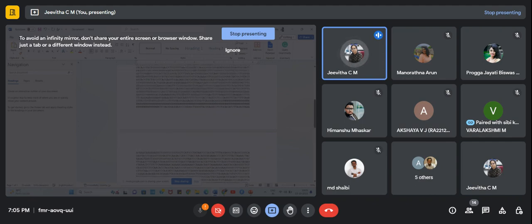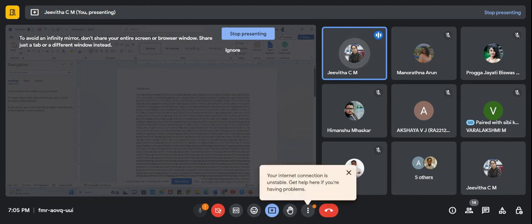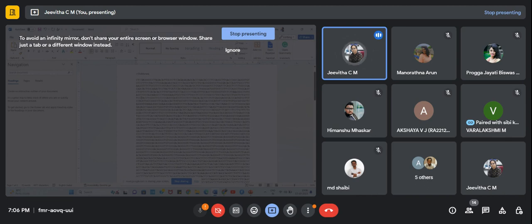So I'm pasting it in a rough page. We can forget this, as this is an insulin, and we can keep it as an unknown sequence. For example, you are doing some NGS data analysis, or you have got this sequence, and you don't know what this sequence is, but you have to design primers targeting its CDS region.